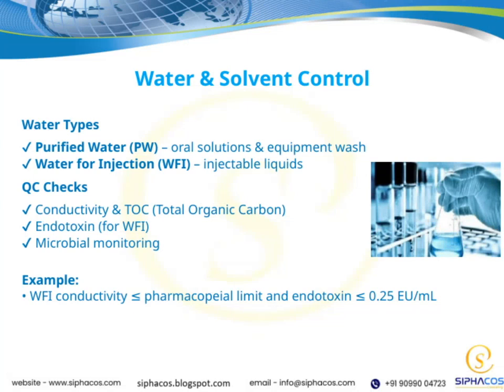First, there are different types of water we work with. Purified water, or PW, is primarily used for oral solutions and equipment washing. It's essential that this water meets strict purity standards to ensure safety and efficacy. Then, we have water for injection, or WFI, which is used specifically for injectable liquids. Because these are administered directly into the body, WFI must be of the highest purity.